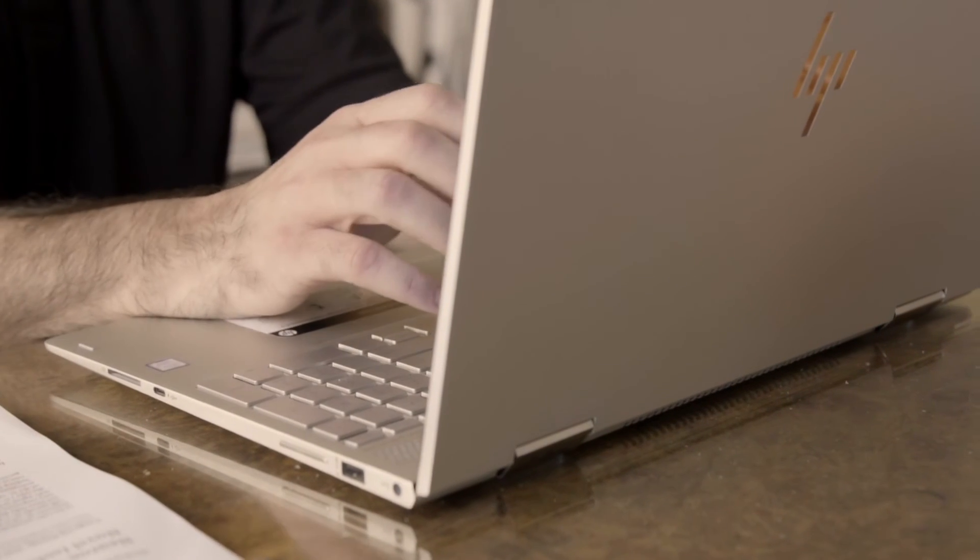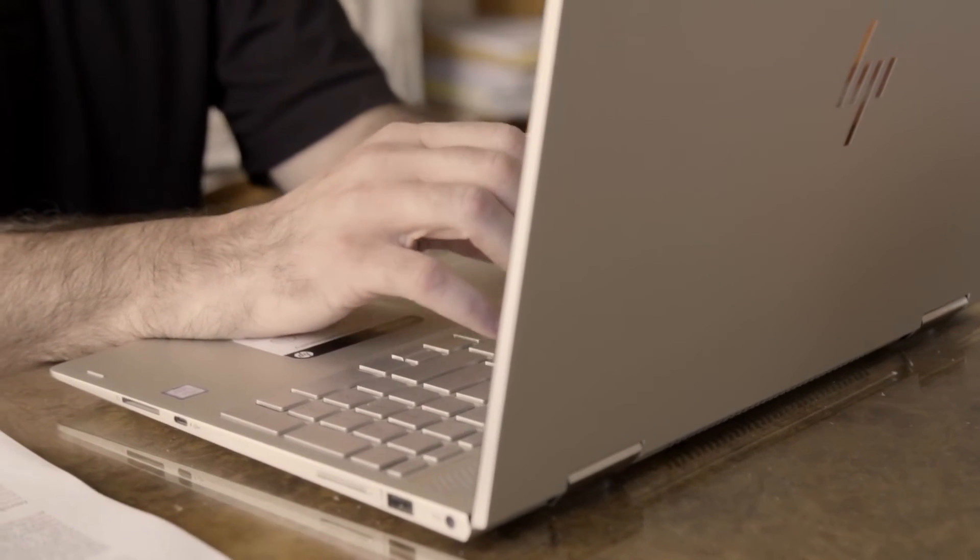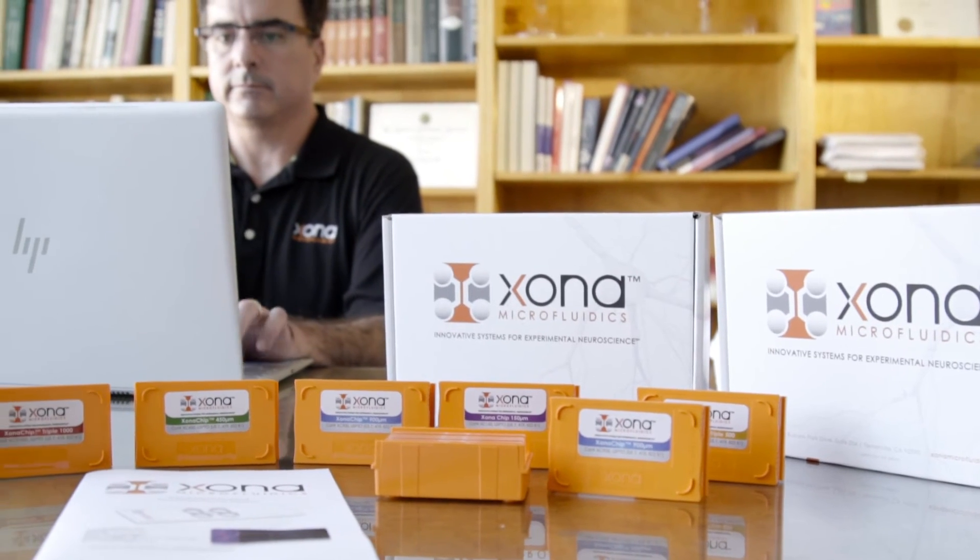The XonaChip definitely improves my efficiency. With past experience with silicone-based devices, I'd get maybe one or two out of five chambers that really looked how I wanted. XonaChip videos and tutorials, as well as the customer service that Xona Microfluidics provides, is very helpful in utilizing the XonaChip.